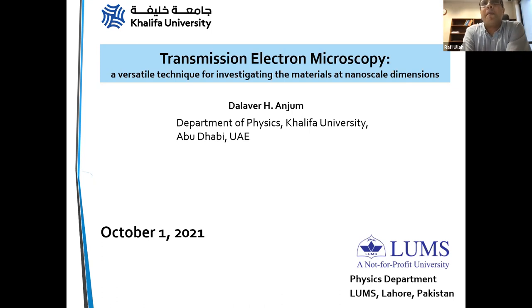So yes, it's my pleasure as well to be here and share my thoughts and knowledge about transmission microscopy with you guys. It's basically an indispensable tool for doing research in nanotechnology. It has been all along very popular, looking at the materials at nanoscales, even before the birth of nanotechnology. But with the birth of nanotechnology, it has gained an even more fundamental role in the field of characterization of materials. So this is why it's a very popular technique among material scientists and even biotechnologists.